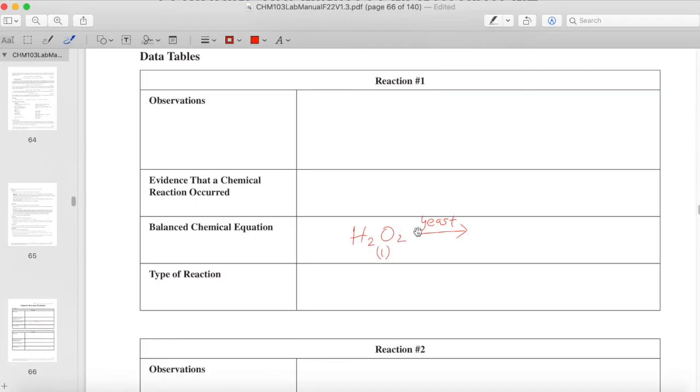All right, now I mentioned, I think, that the hydrogen peroxide basically reacts and leaves you with water, which is a liquid as well. There are reactions where water gets given off as water vapor, but in this case it is just liquid water. And you'll recall we saw bubbles. The bubbles we observed were oxygen gas.